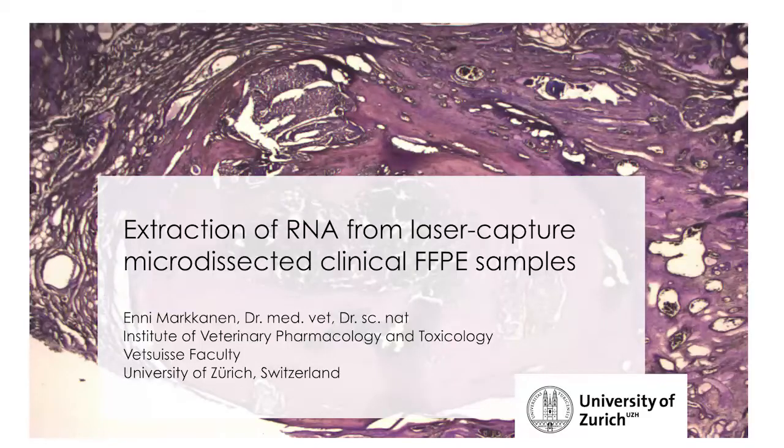Thanks, Michael, for the introduction. In the next 15 minutes or so, I would like to share with you how we are using extraction of RNA from laser capture microdissected clinical FFPE samples to help our research.